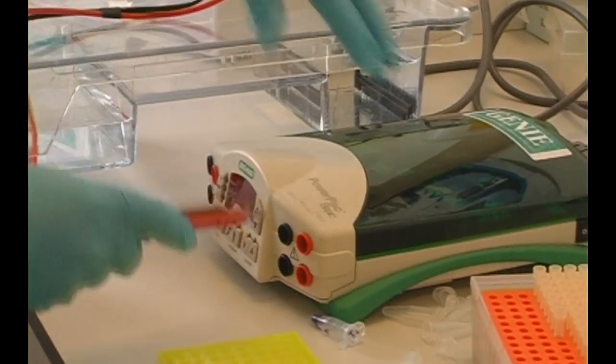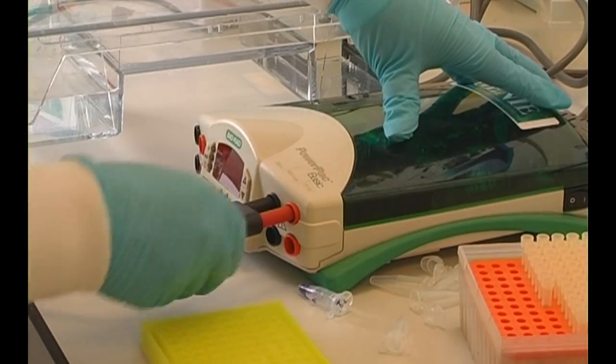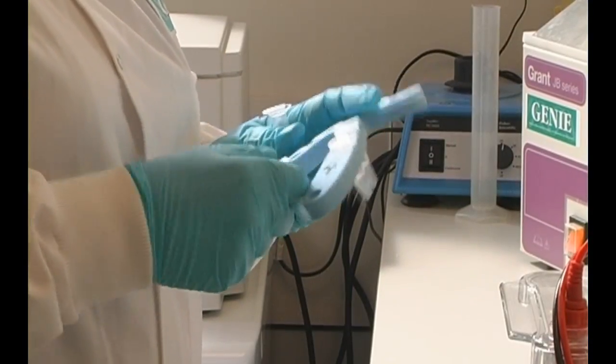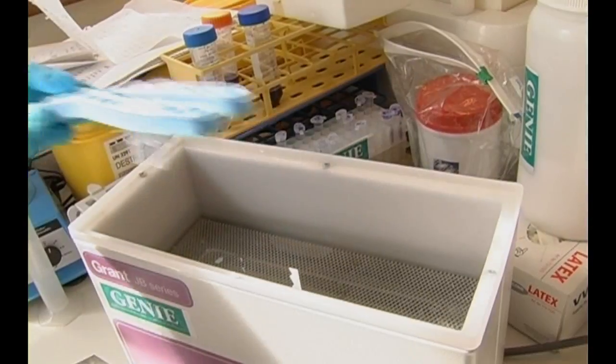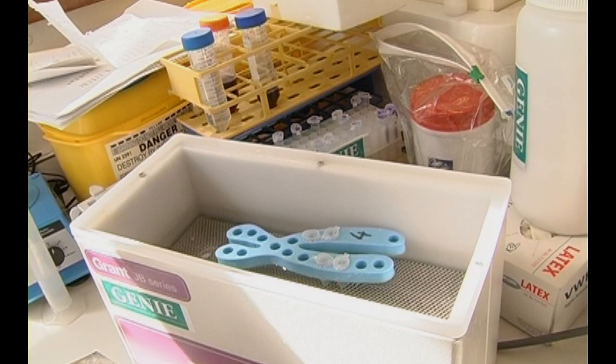When you graduate, you'll be a doctor. You'll order genetic tests for your patients, and they'll be done for you. Right now, you don't have hours to spare learning how these tests are done, so you just get this demonstration. We wanted to change that.